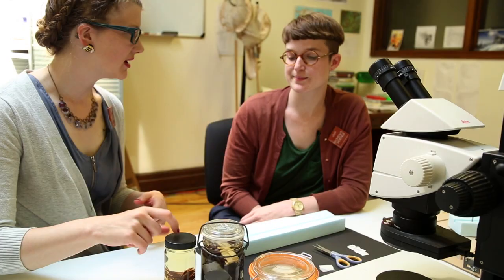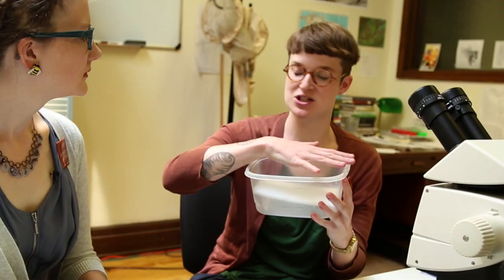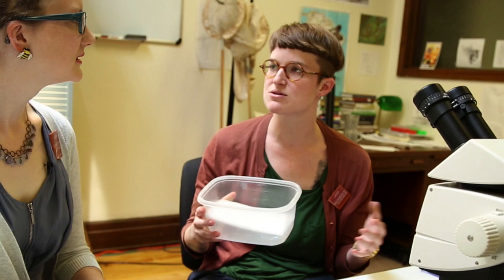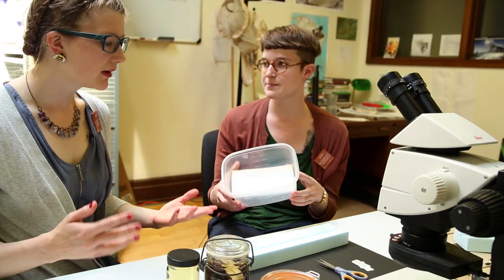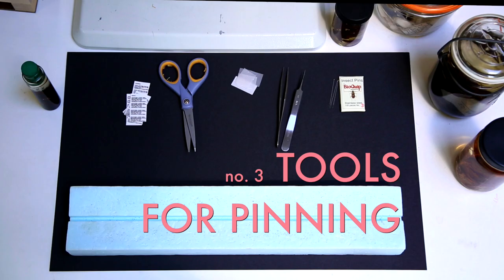We're going to be pinning insects that came from jars of alcohol, so they're already well hydrated. But if you find a dried-up dead insect, pinning it is pretty hard because it's brittle. You can rehydrate or relax it — just find a Tupperware, put a piece of foam inside to elevate the specimen, pour really hot water in, and shut the lid. It's like a sauna for the insect, which relaxes the tissues so you can move the legs and wings again. A grasshopper might need a day or two, and you can keep replenishing the hot water to keep it warm and steamy.